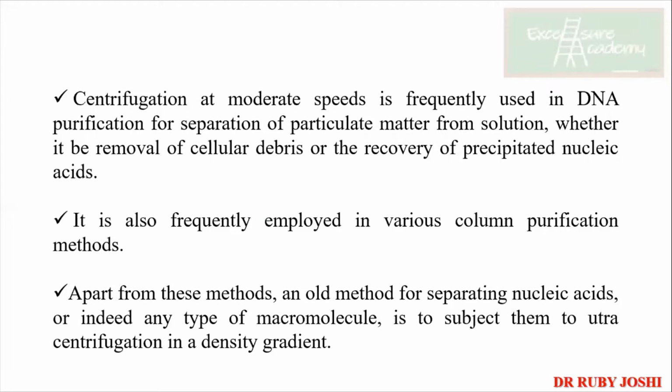So you know what is centrifugation. Now there are 2 types of centrifugation. One is gradient and one is isopycnic, out of which for separation of DNA, we need gradient centrifugation. And here we don't purify DNA. What we purify is nucleic acid. Sorry, I'm saying nucleic acid, I meant nucleus. Are you understanding the difference? When I say that I'm going to purify nucleus rather than nucleic acid. Yes? Any confusion with the word?